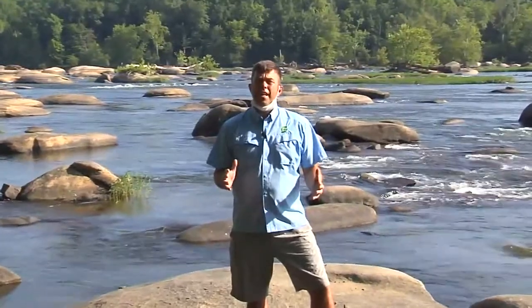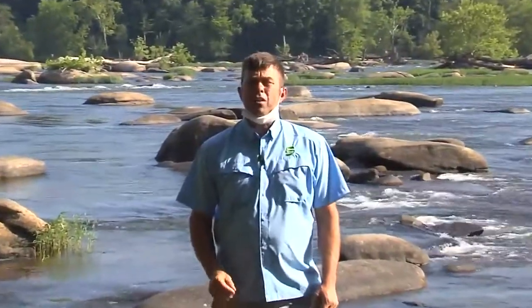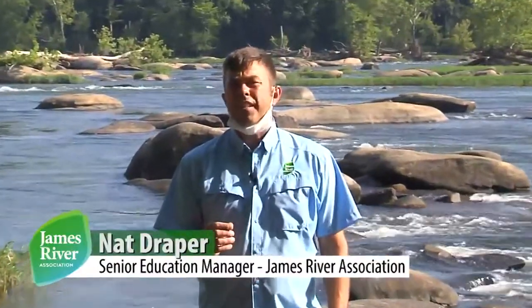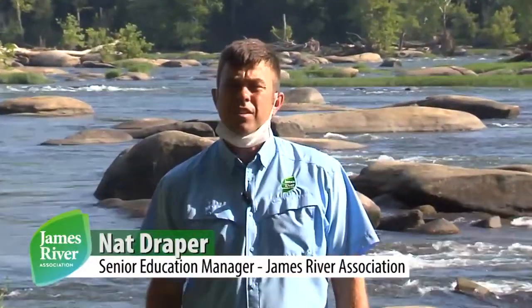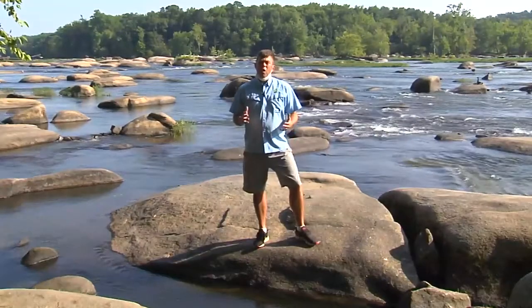Our topic of today is water quality testing. We're going to be doing our absolute best to social distance today. If we are within 6 feet, you're going to see us wearing our masks. Let's get started. Today's topic of the day is water quality testing.